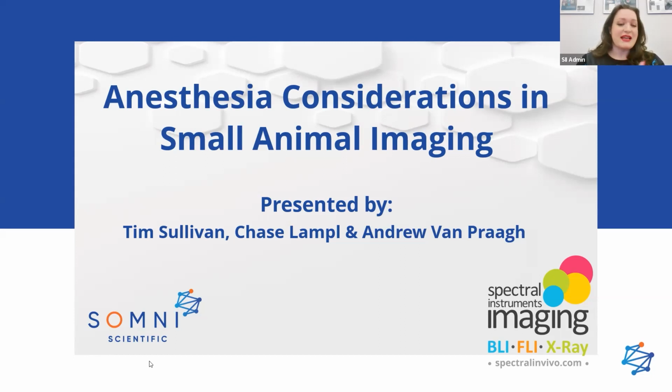I am personally very excited about this topic because many of the questions and support requests that we receive from our customers actually have more to do with anesthesia settings than they do operating the actual optical imaging system. So to demystify the process, we gathered a brain trust of experts, both from SII and Somni, to discuss the use of anesthesia with your in vivo imaging systems.